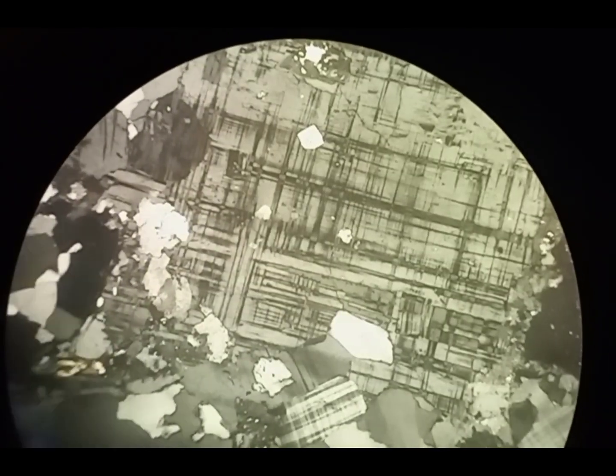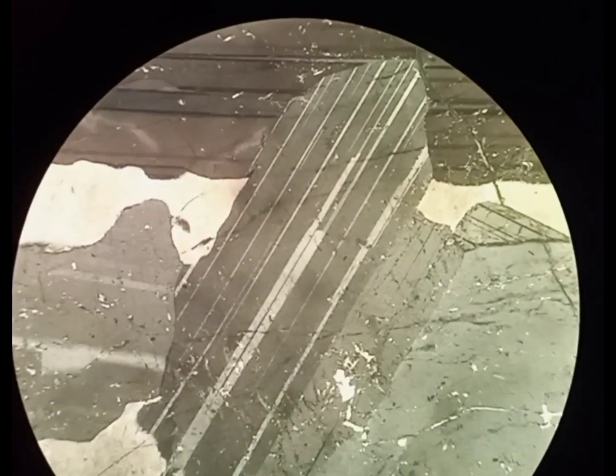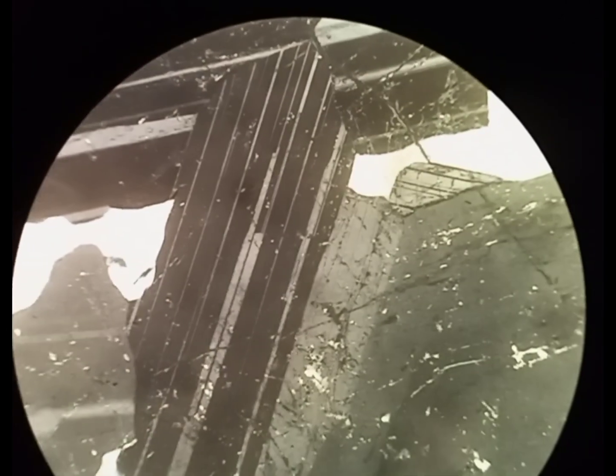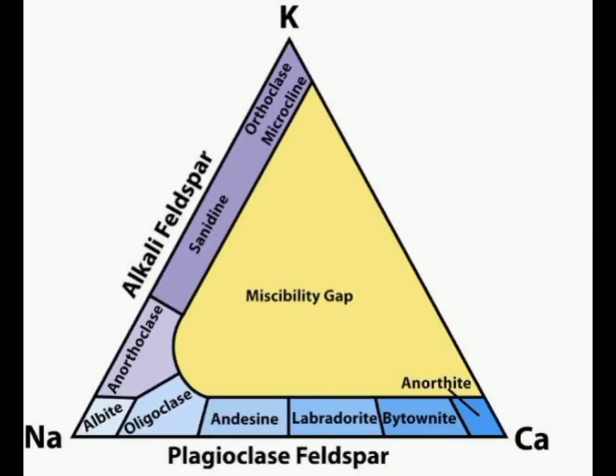On rotation of the stage, it shows gray to white color. It shows different kinds of twinning, which is an important characteristic for the identification of feldspar in XPL mode. We have two types of feldspar: alkali feldspar and plagioclase feldspar.